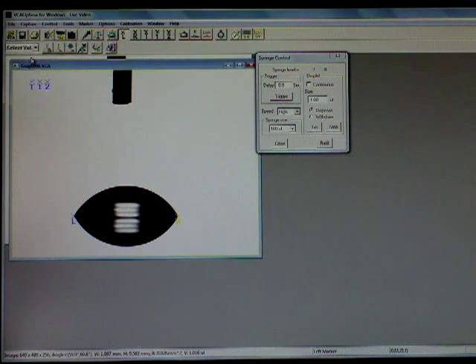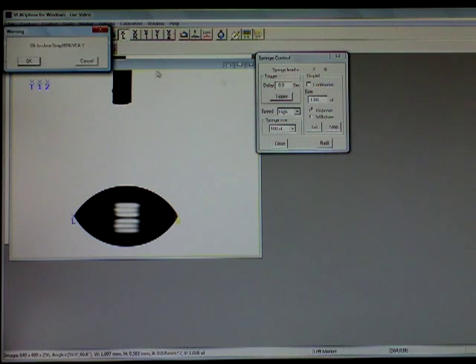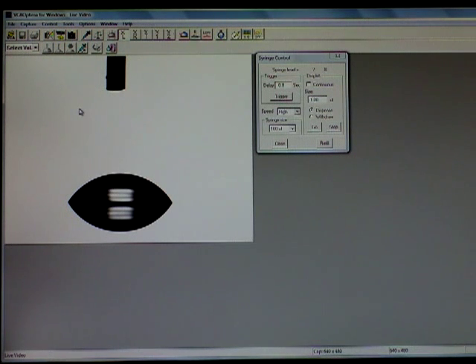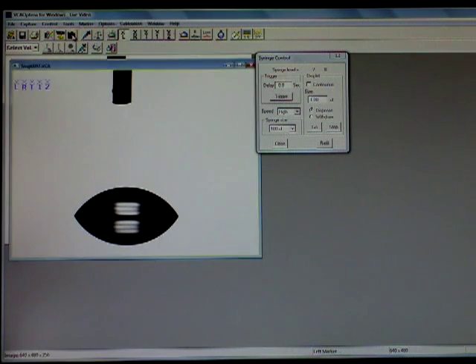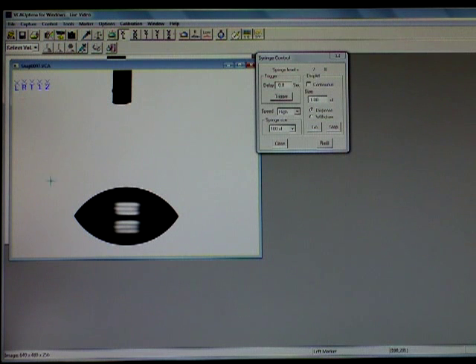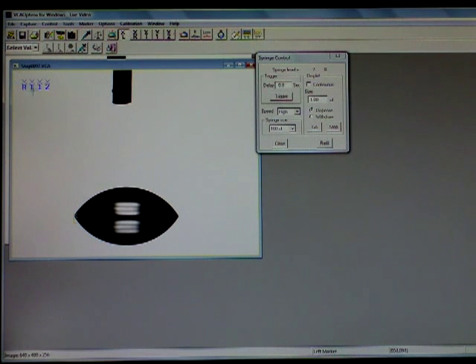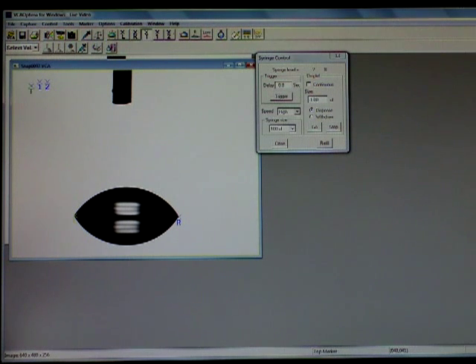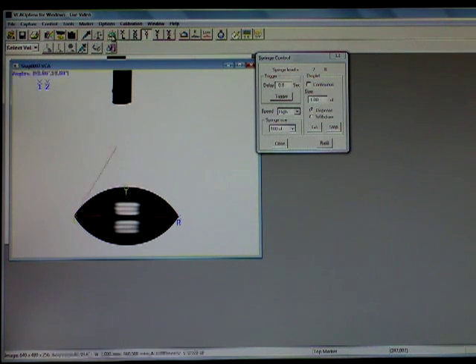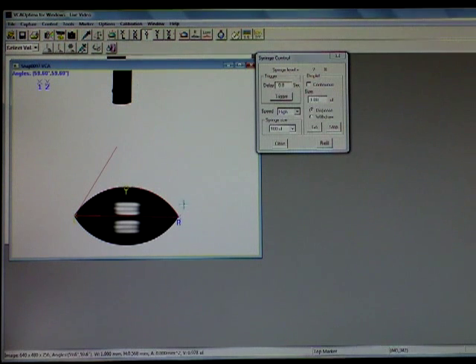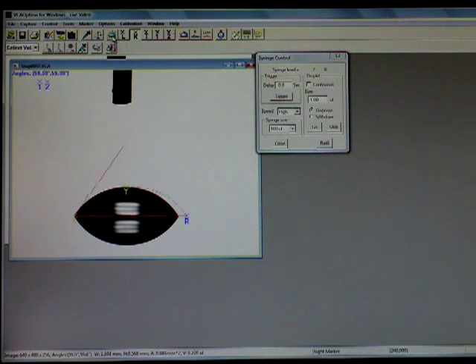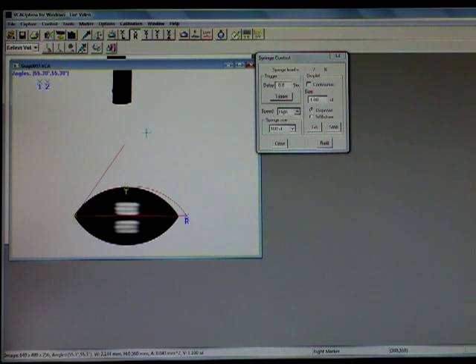Another feature I'll show you now is how to manually check a contact angle. Instead of using the auto fast which will automatically do it for you, you would take a picture of the screen. Then you would set your points left, right and top and then hit measure and it will measure the contact angle for you. As you can see, if it's moved at all and you hit measure, it will measure depends on what you put in for points.